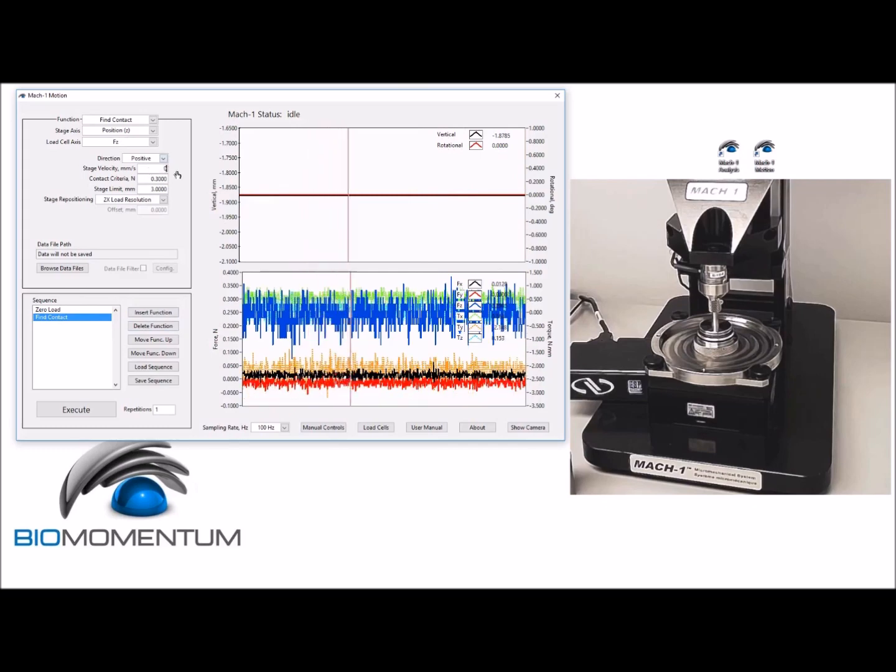And a contact criteria of 0.3 Newton, a stage limit of 3 millimeters, and a stage repositioning of 2 times the load cell resolution.